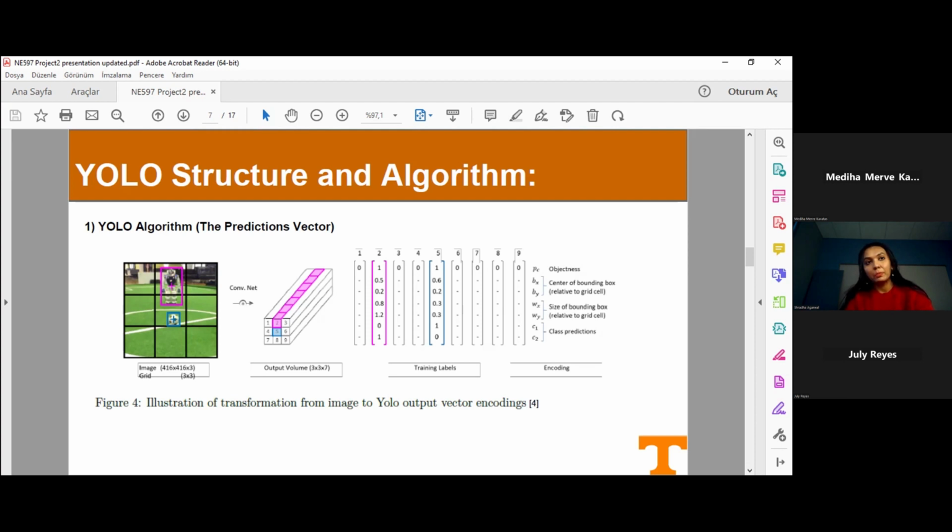That bounding box is a spatial position in the image, an imaginary rectangle that it predicts, but then it optimizes the prediction based on the training, right? And there it uses regression.